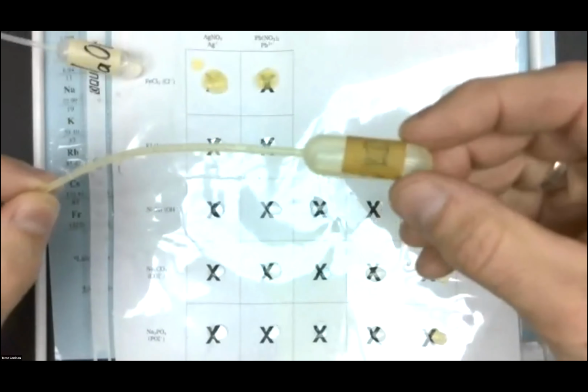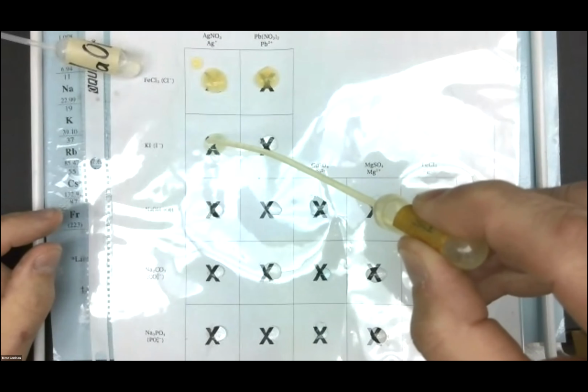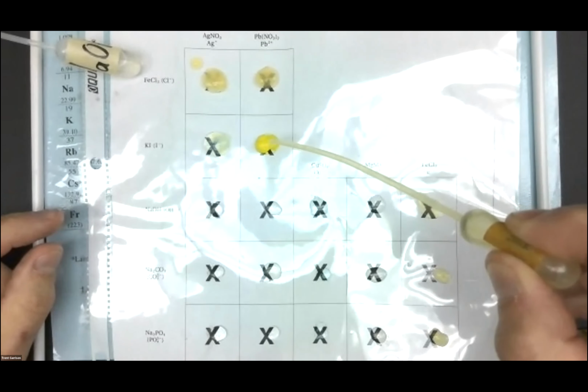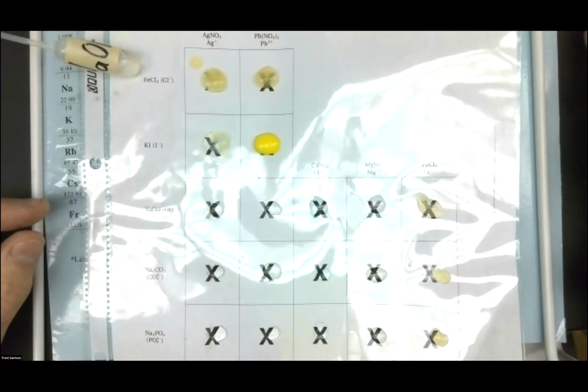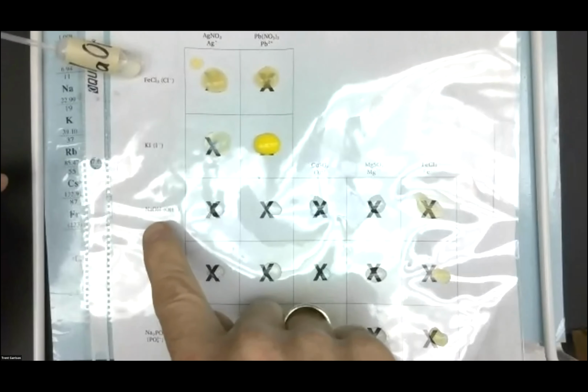Okay, then I'm going to come over here to KI, which is the next row going across, and it's a yellowish compound I've got right here, KI, and I'm going to add drops to that. Well, it started out as definitely clear, and oh goodness, as I add something to it, you'll notice there were definite changes. Again, a little cloudy, but here, that's mustard yellow, clear. All right, NaOH.